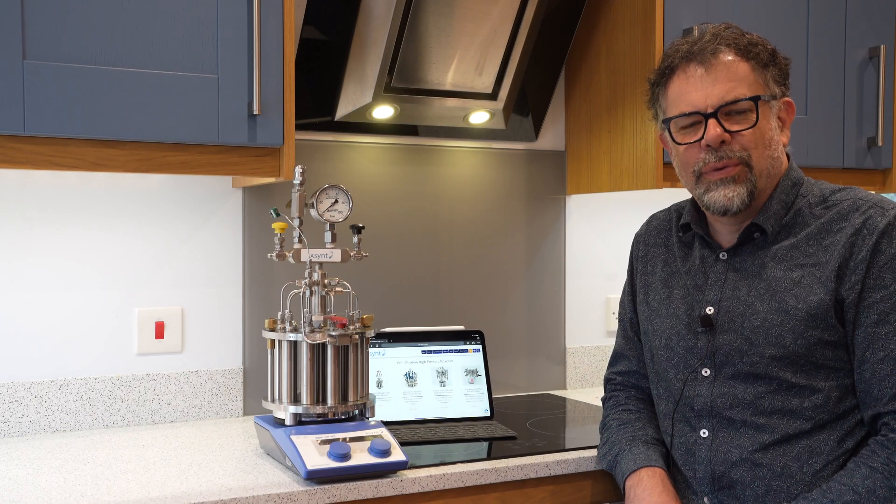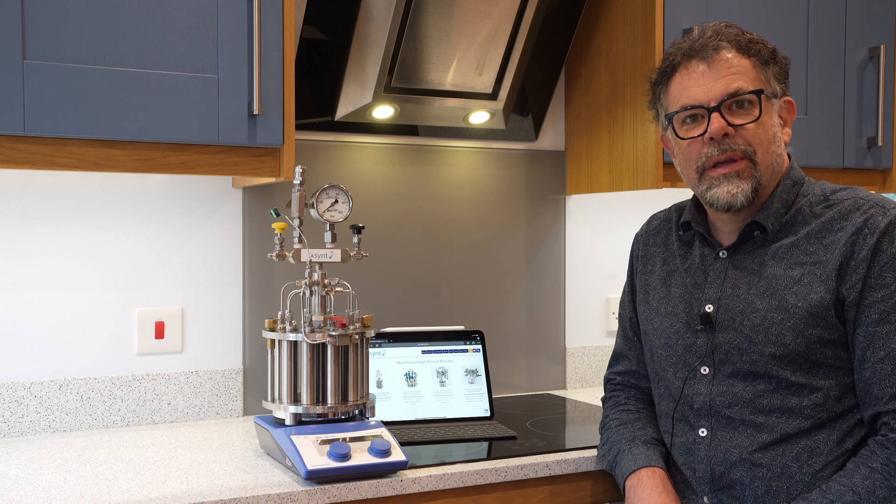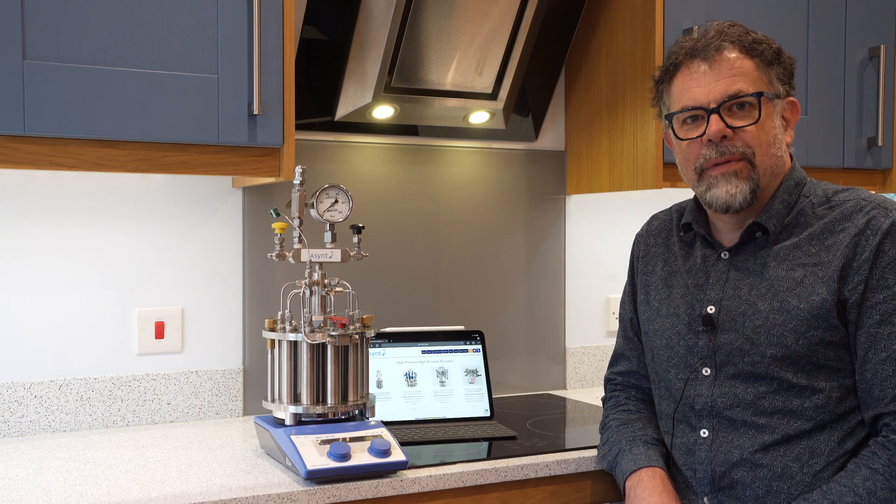Welcome to Ascent. My name is Martin Fordham and today I'd like to show you our MultiCell. It's a parallel reactor for high pressure chemistry.